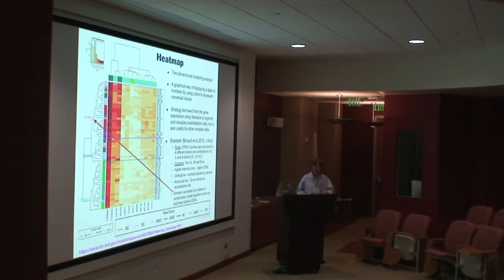Okay, so here's another tool, and this again is a wrapper for an R package, basically for doing hierarchical clustering. The point is, generally speaking, if you have a table with some values in it, you can turn it into a heat map.